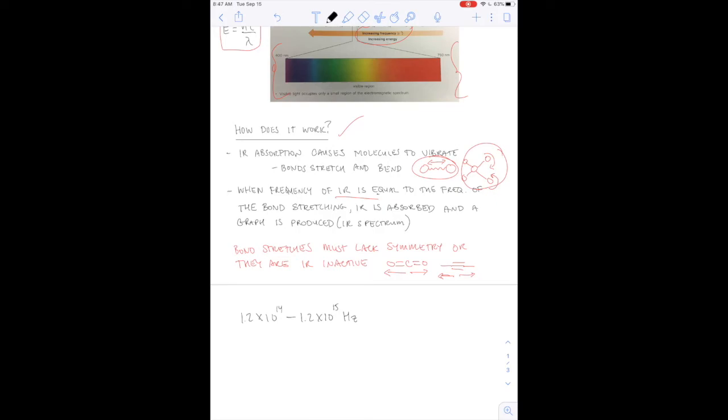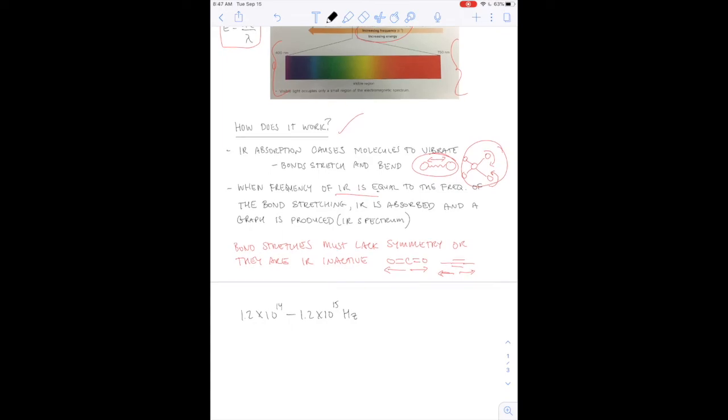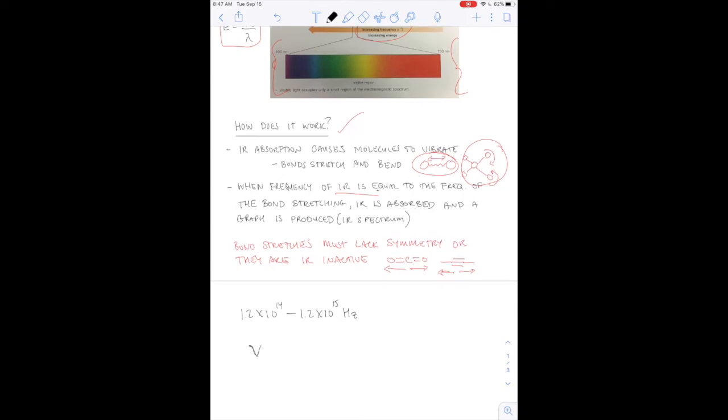We're not trying to report values for what this particular functional group absorbs in this range of numbers. It's crazy. And so what we actually do instead is we convert our frequency to wave numbers, and this is denoted with what looks like the nu, but with a little wavy line over it, and this is equal to 1 over the wavelength.